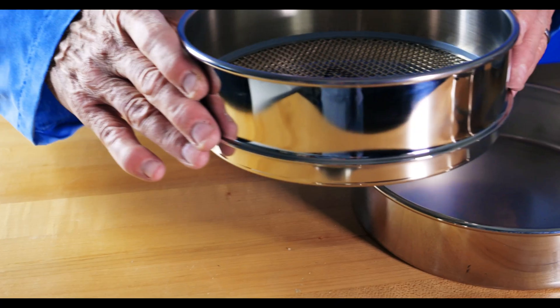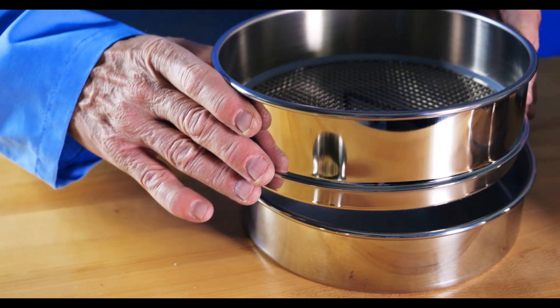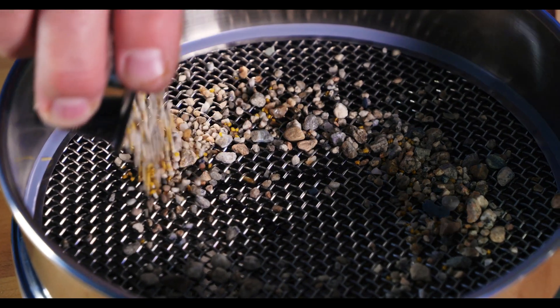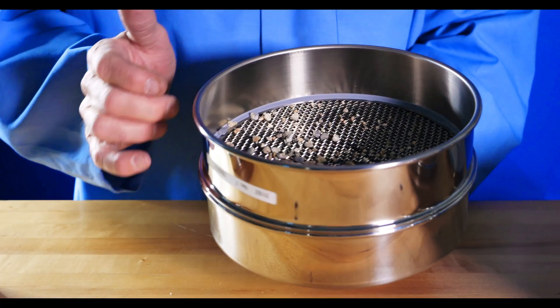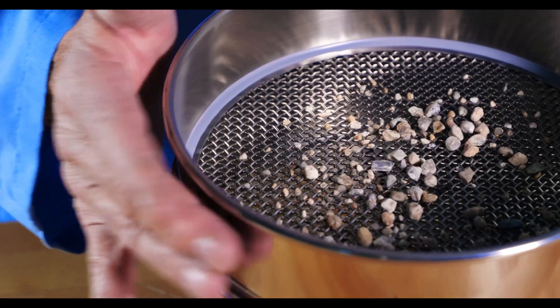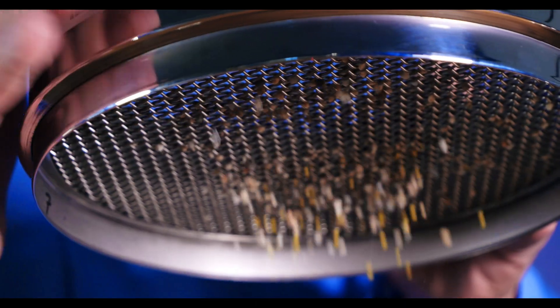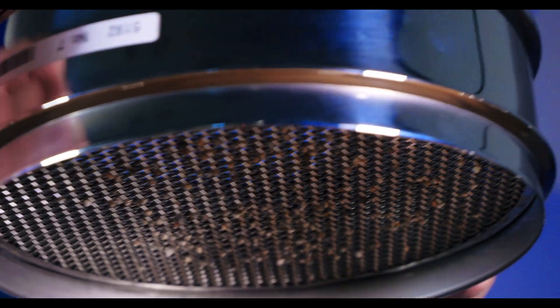Once your equipment is prepped and your representative sample is gathered, you can begin testing. Typically, you'll use one sieve seated into a collection pan and use these following steps: pour your sample material onto your sieve surface, rotate the sieve with one hand while gently tapping the side of the frame until most of the finer material has passed through into the pan. This typically takes one to four minutes to complete. You can either perform this with the sieve level or at an angle, depending on your material.